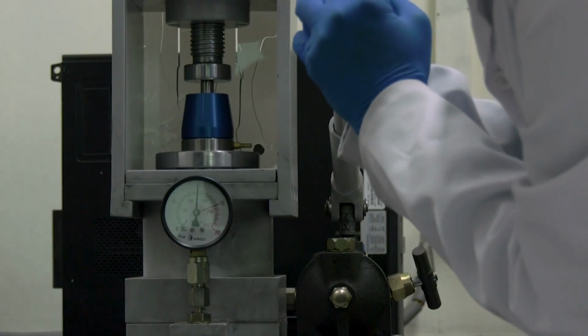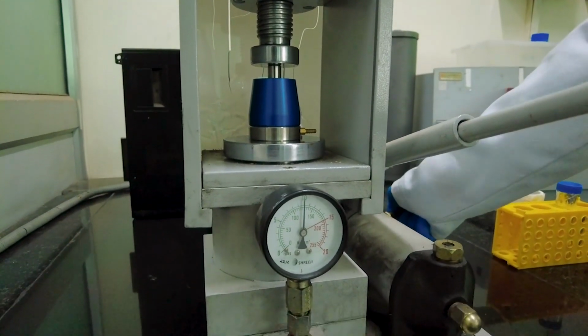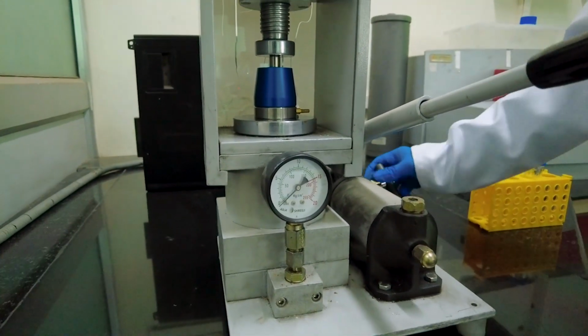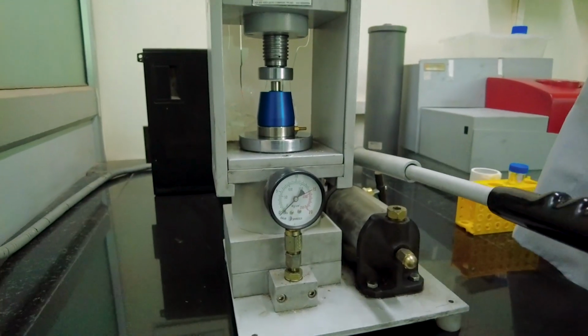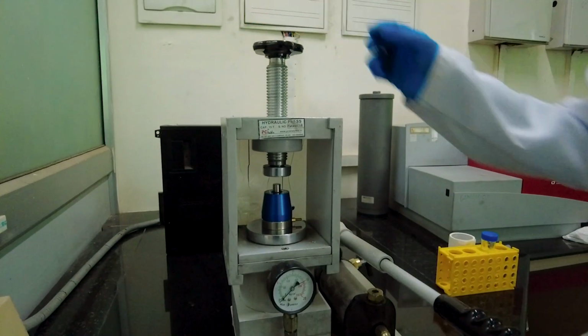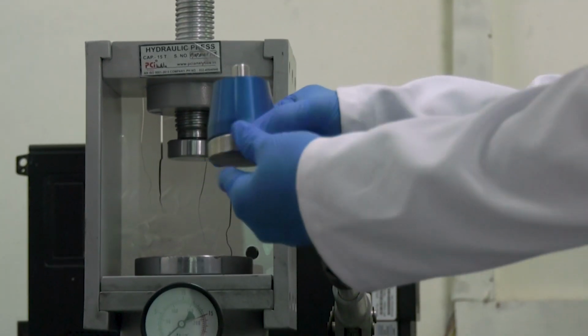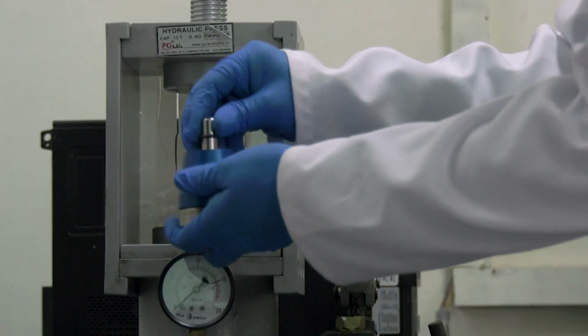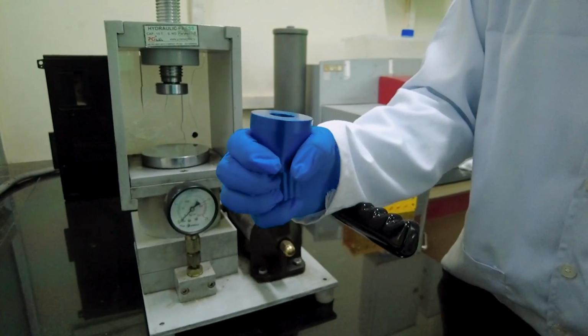Once it is done, first release the pressure using the pressure valve. You can see that the pressure has gone down to 0. Now loosen up the screw and take out the pelletizer. Take out the rod first and then remove the lower part of the pelletizer carefully.